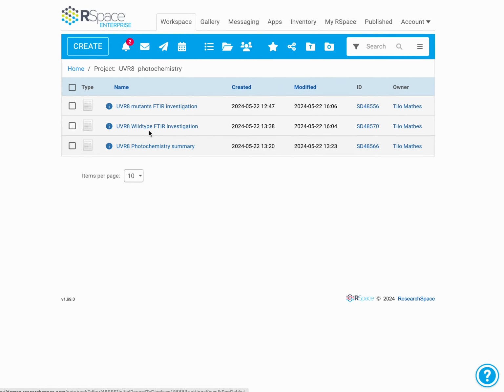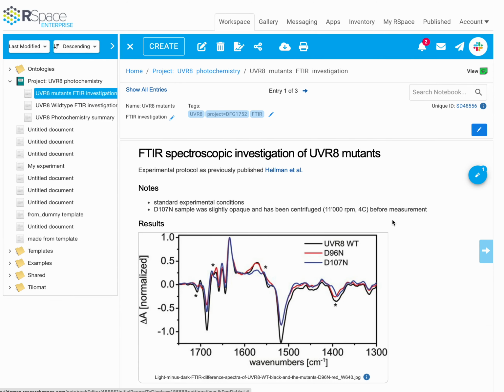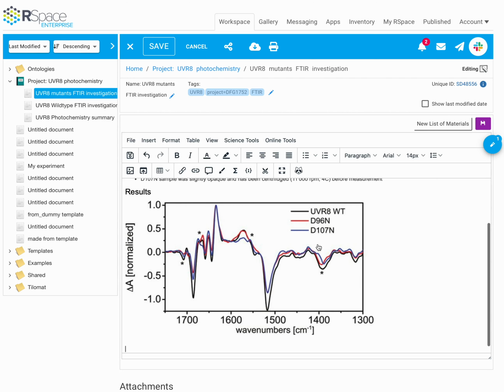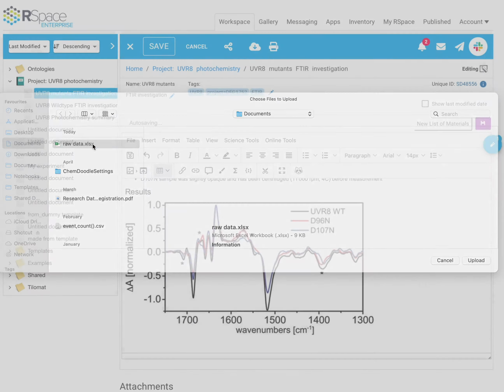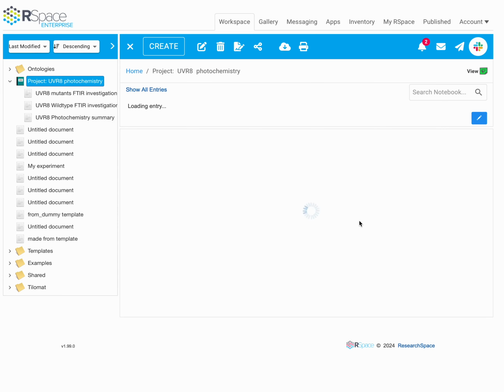Since RSpace version 1.99, we've added further functionality to allow RSpace users to move or copy files from RSpace to iRODS. When a researcher documents an experiment in RSpace, they often add files, such as images or data, from their local machine to their RSpace documents. These files can then be found in the gallery along with their RSpace metadata.